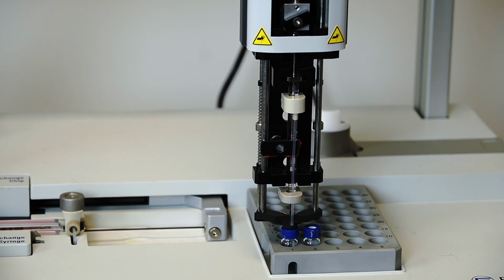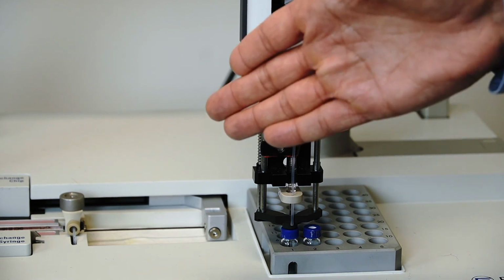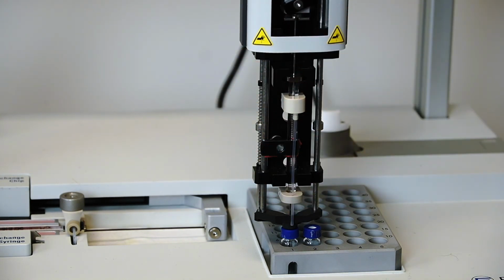And so it's slowly drawing up sample so that no bubbles are introduced into the test syringe, because bubbles can lead to artifacts in the data. So it draws very slowly so that no large bubbles are introduced.